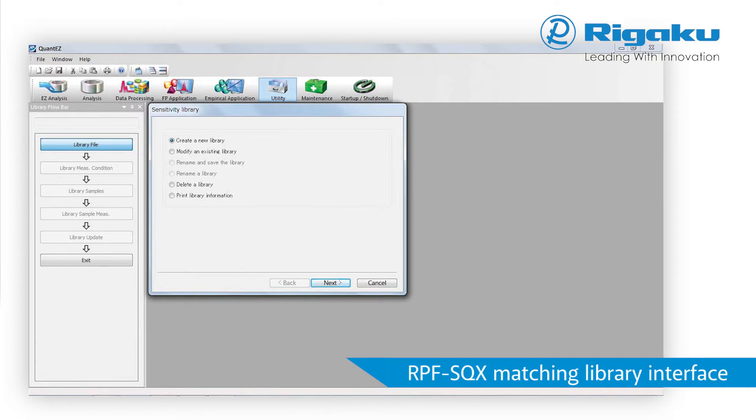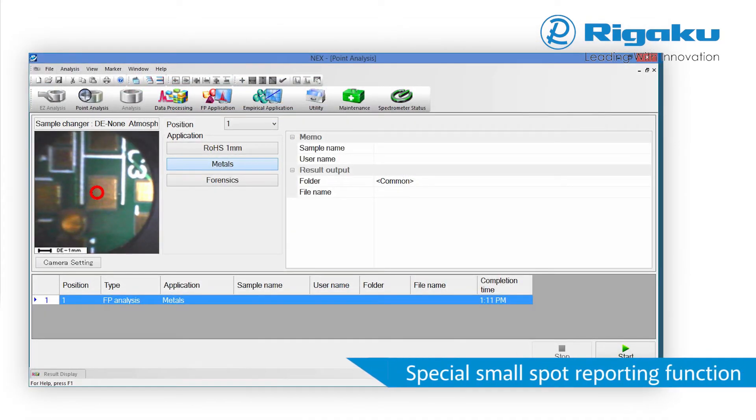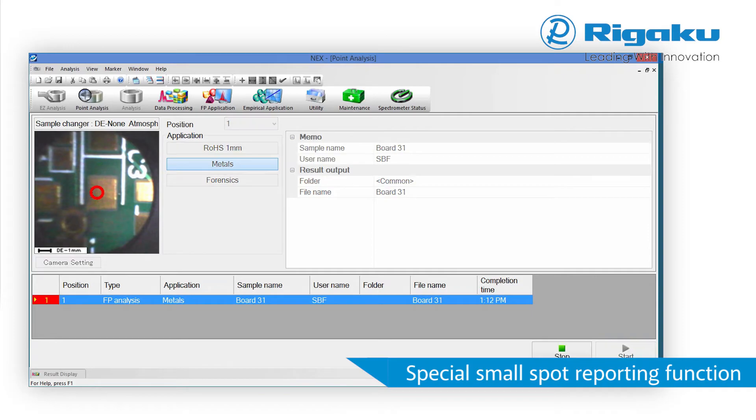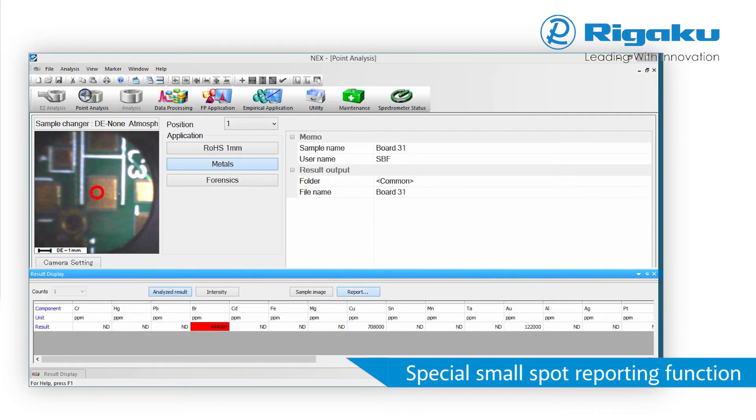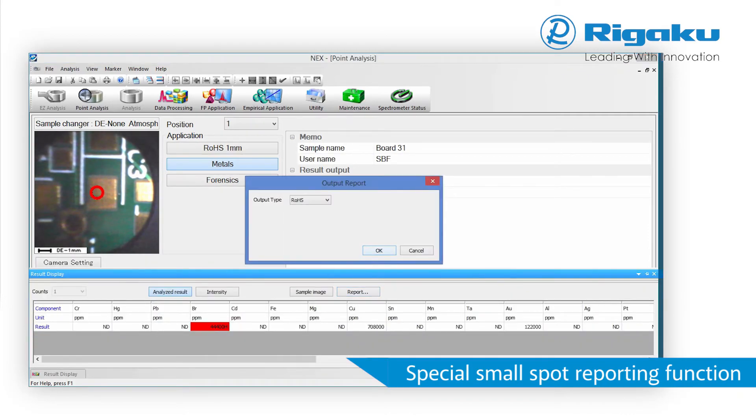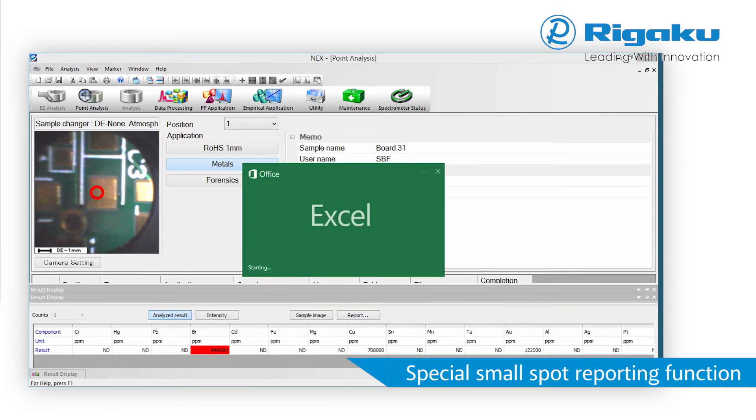Increased accuracy is achieved using a matching library. For small-spot analysis, the NEX DEVS incorporates a special spreadsheet-based reporting function that includes an image of the analyzed area.